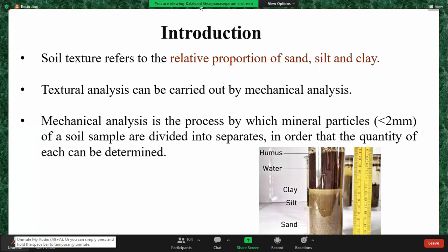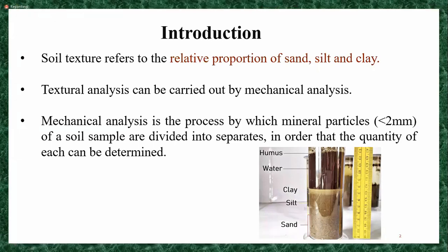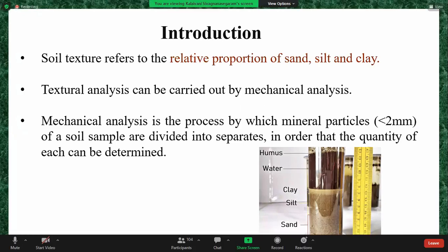Not accurate, so this can vary with persons, so there may be so many errors. The advantage is what? No need of equipment and other things. Easy. Yeah, easy method, very simple method, right?